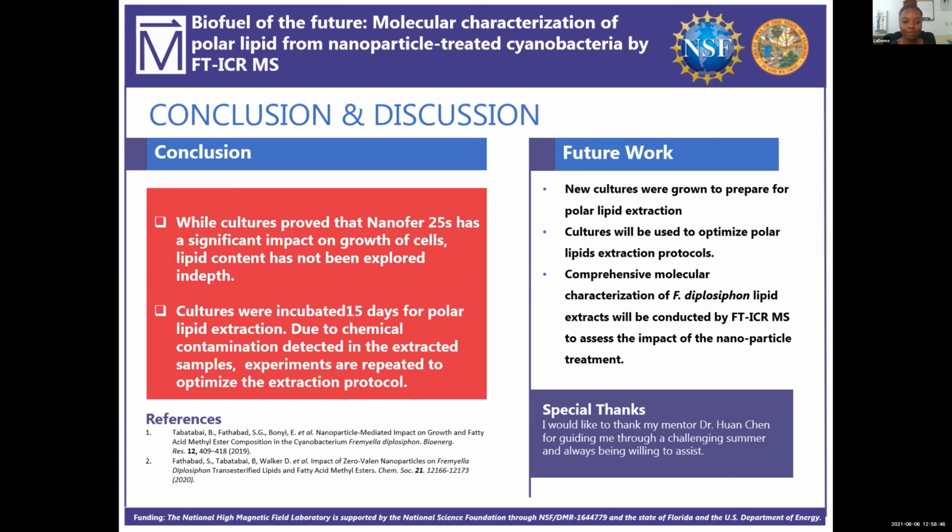Polar lipid extraction was performed but did not produce conclusive results due to chemical contamination. Moving forward, we have attained numerous new flasks for growing cultures, which we hope will prevent the reoccurrence of this issue.